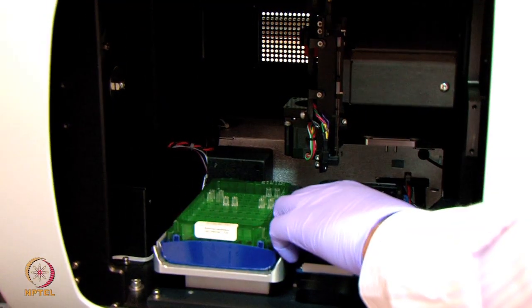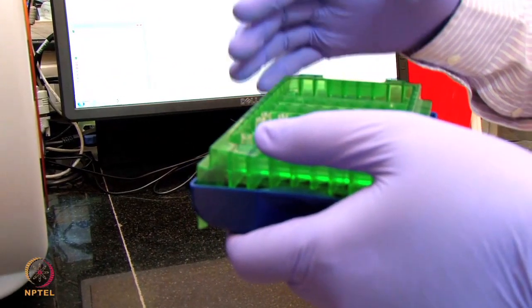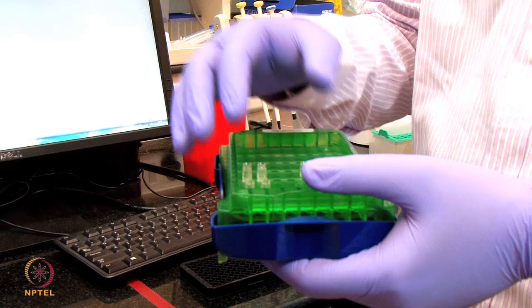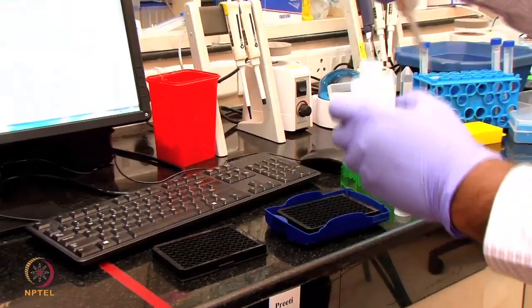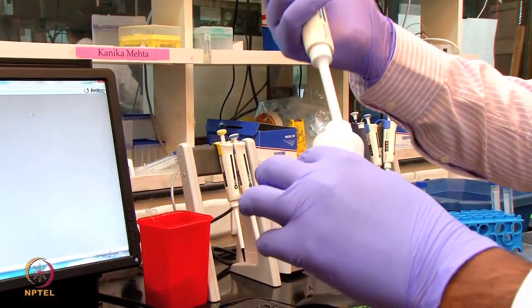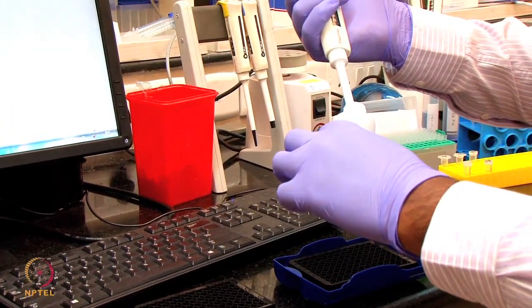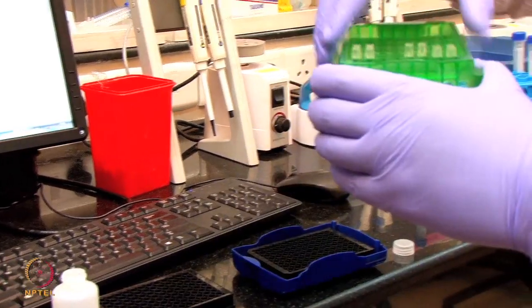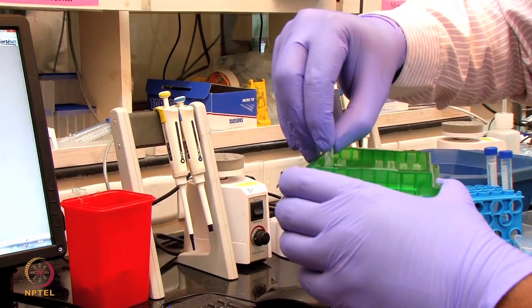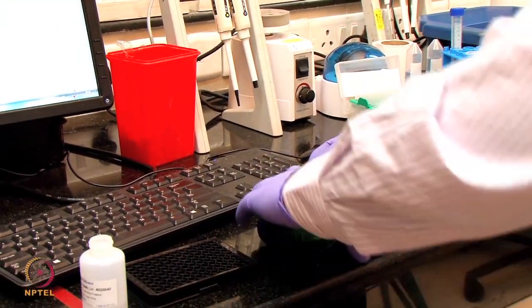Now I am going to take back this sample plate and also the sensor tray. This sensor is hydrated in the PBS buffer, and our biotinylated antibody is also in the PBS buffer. Now I am going to equilibrate these sensors with the PBST buffer, the PBS buffer having Tween in it. We call it the sample diluent buffer. Here I am going to take a 200 microliter drop of this PBST buffer and add it in A2 and B2. Now I am changing the sensor position from A1 B1 to A2 B2, and I will start the equilibration of the sensor with this buffer.